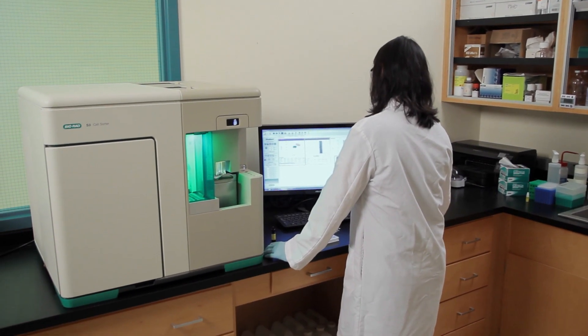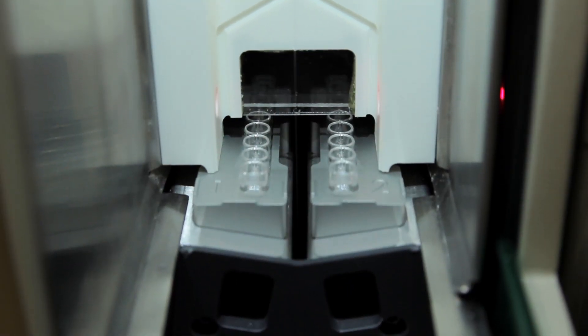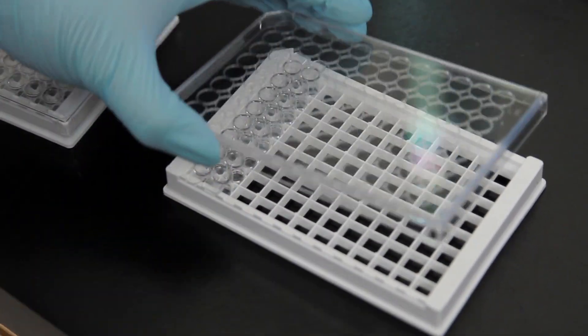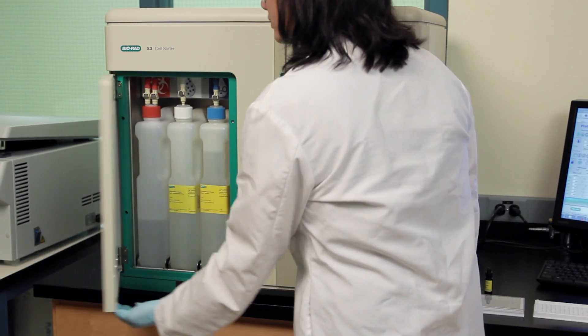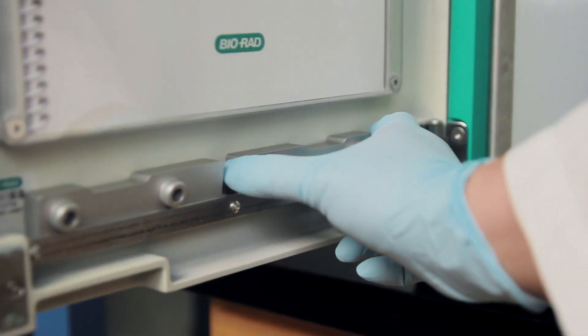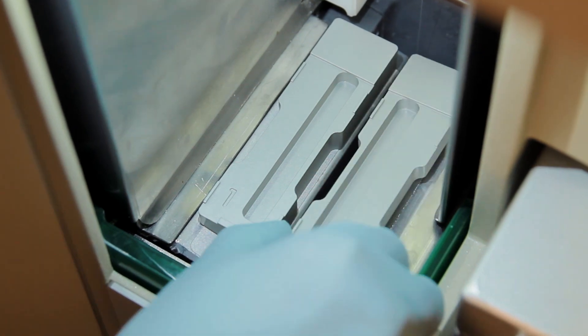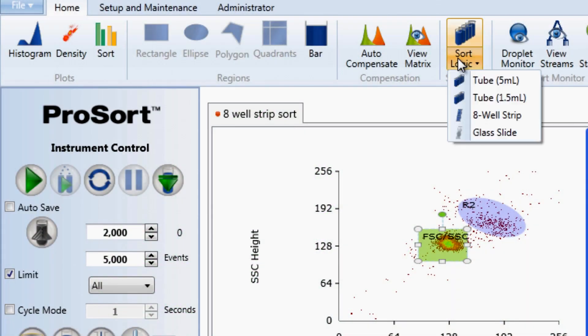Easily handle plate sorting by using eight-well strips. See how quick and easy it is to generate a 96-well plate on the S3E cell sorter. Collection adapters fit seamlessly with the sort output sled. Keep yourselves healthy using the onboard temperature control system.